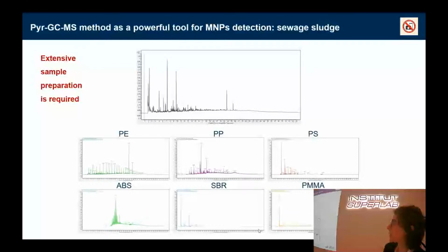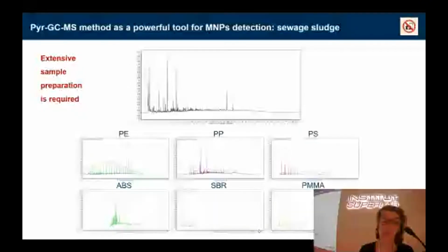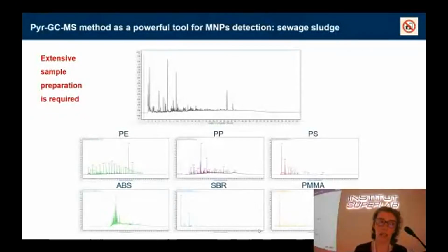Of course, these are all ongoing. They will be future, because ISO standards are also putting pyrolysis GCMS as one of the methods that can be used.